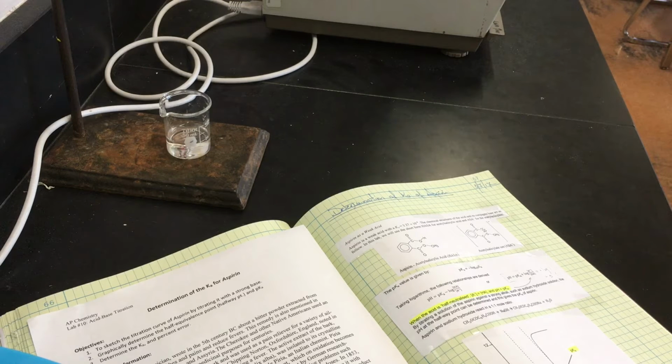So we're going to do that, standardizing the base using KHP, which is potassium hydrogen phthalate. And the reason why we're going to use that is because it's an actual solid.